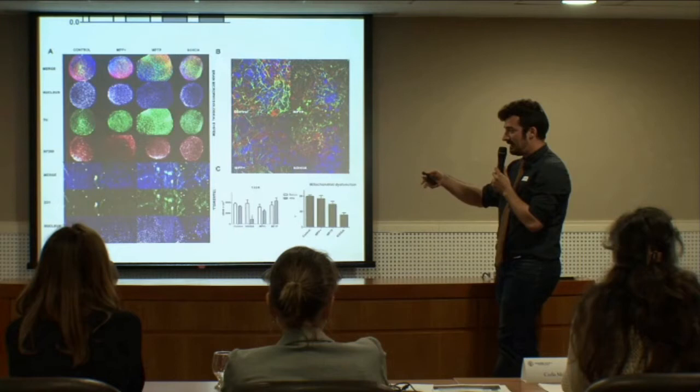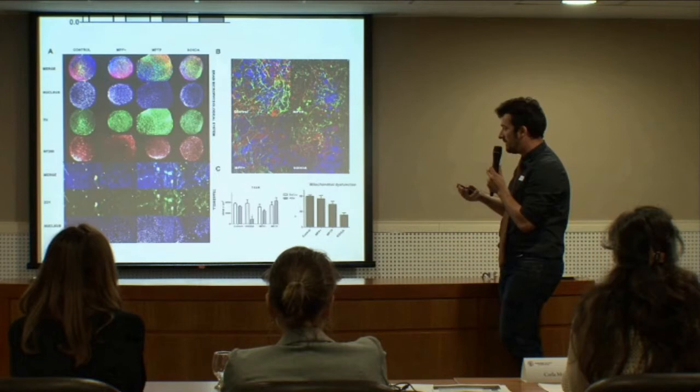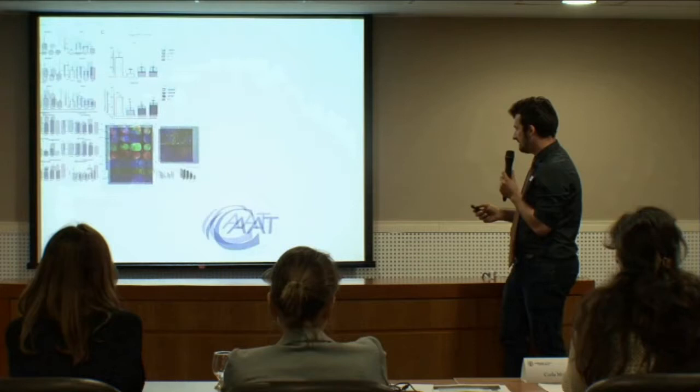The main bottleneck for drug screening is that the chemicals will not cross the blood-brain barrier. So with this, we can incorporate both things at the same time. In this case, we used it to see if the penetration of the different chemicals would cause a disruption of the blood-brain barrier, or was more like a diffusion. But I'm just going to skip that.